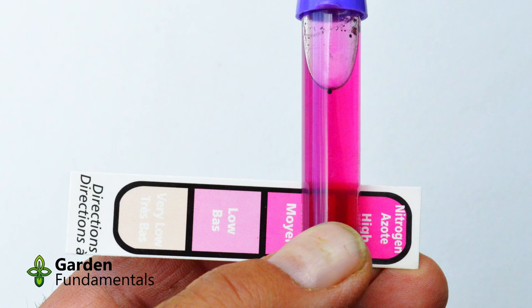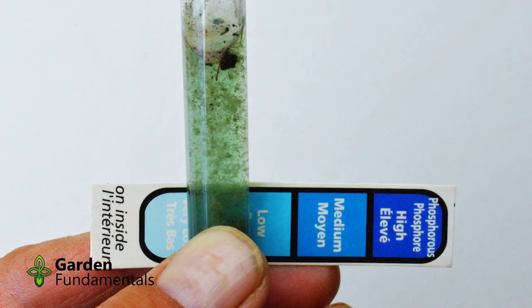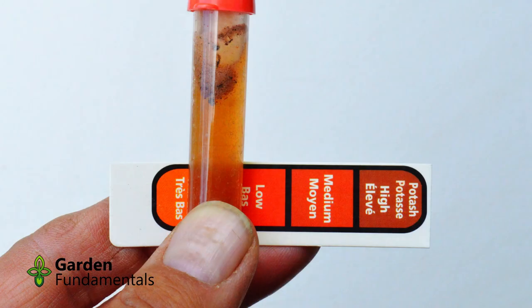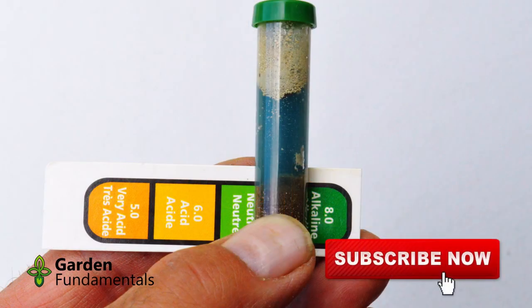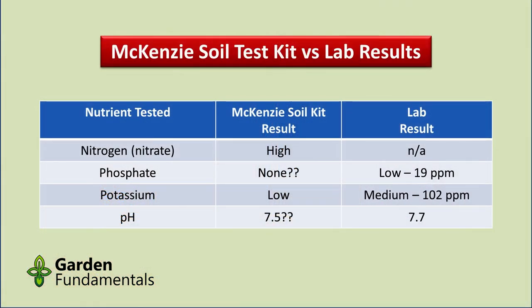Here's the result of my nitrogen test, which is between medium and high. The test for phosphorus didn't seem to react properly — the chemical never dissolved in the water and no color was formed. If I had to guess, it's very low, but I don't think this test really worked. The result for potassium is very low. I'm not sure what to make of the pH test — the color of the solution is blue, but that does not match the color patches. This demonstrates one of the problems with this type of kit: it can be very hard to match colors.